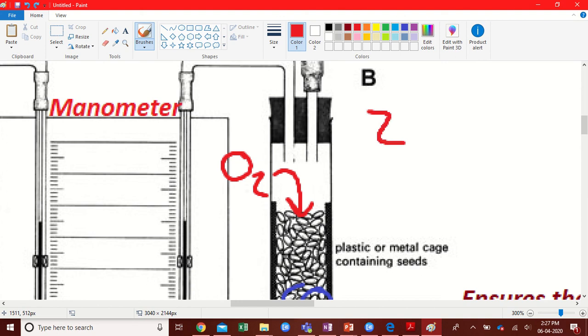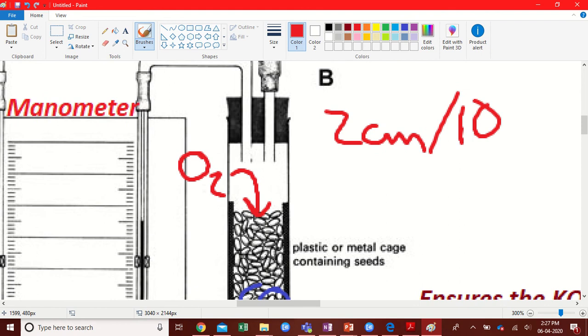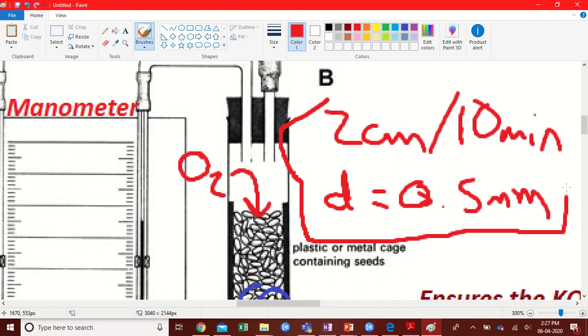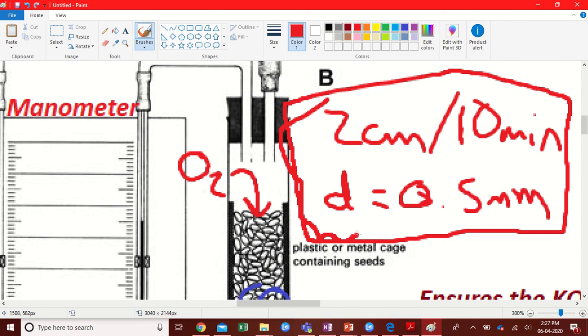So let's say it moves 2 centimeters in 10 minutes, which is a fairly decent normal rate for this amount of seeds. So you know that it's moved 2 centimeters, and also you should know the capillary tubing radius or diameter. So let's say the diameter of the tubing is 0.5 millimeters. So knowing that, and they'll probably give you the equation in the exam to figure out the area of a cylinder, you could figure out the volume of oxygen being taken up. And that's pretty much it.